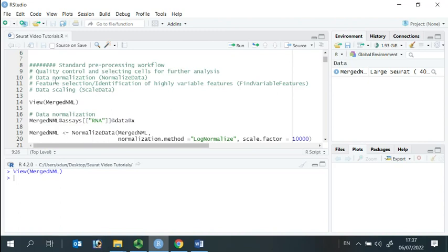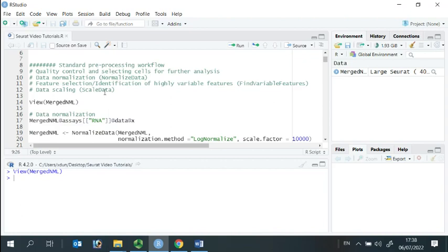Seurat has a command for each step: the normalize data function for data normalization, the find variable features function for feature selection, and the scale data function for data scaling.